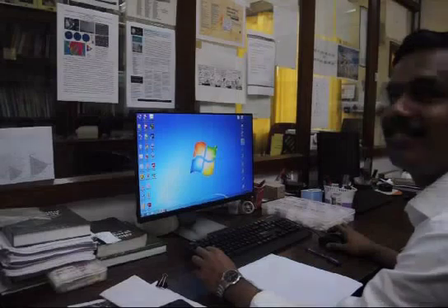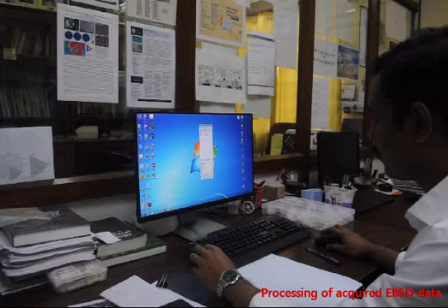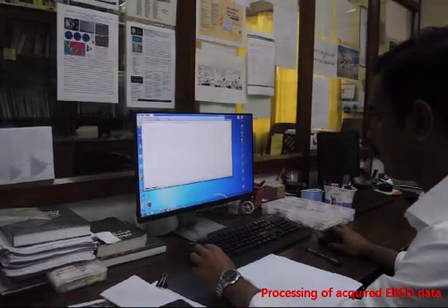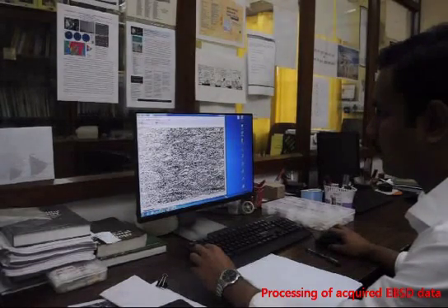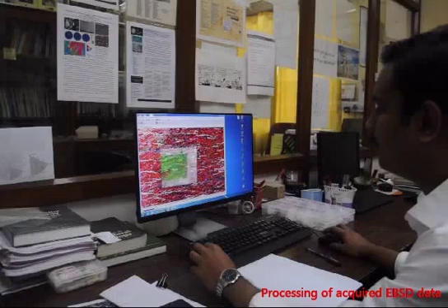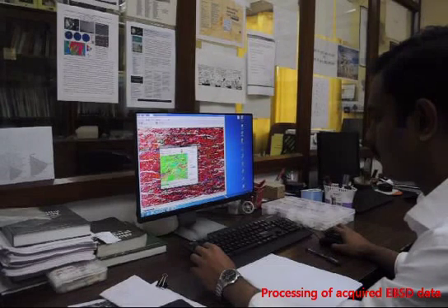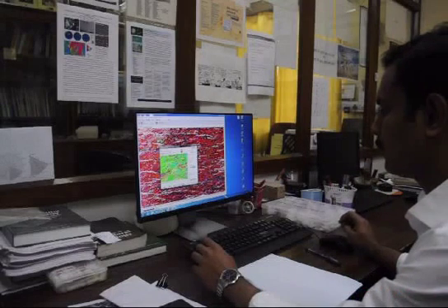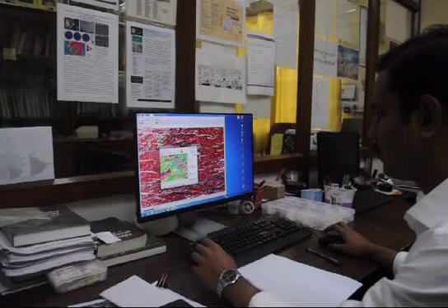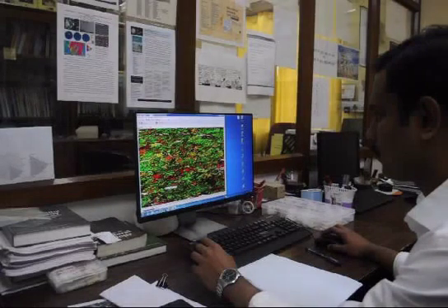This is Ranjit — he works on EBSD and does extensive processing of EBSD data acquired in the central research facility at IIT Kharagpur. We have a license provided by Oxford Instruments, UK, to process the acquired data here in the lab — which we now call the FAL, Fabric Analysis Laboratory. He is currently processing data from a mylonite from the Eastern Ghats region of India.